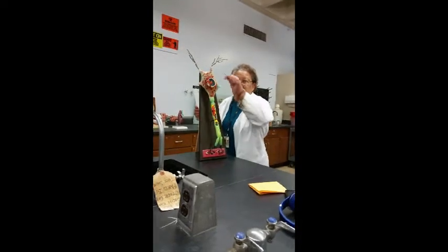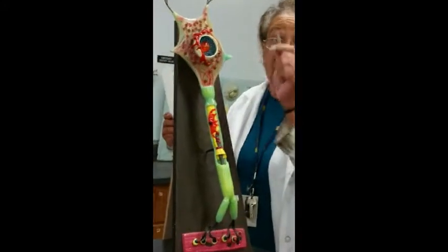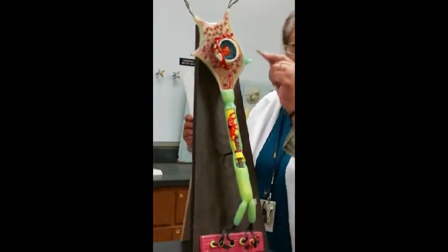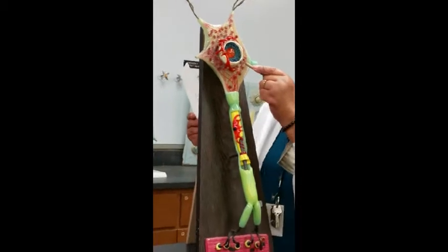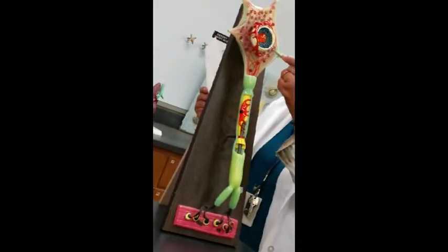That's the cell body, and this would be the nuclear membrane. I'm not adding anything, I'm just pointing out. This is the cell body. This would be the nucleus. That's the nuclear membrane, and inside would be the nucleolus. And you have the chromatin material like any typical cell body.